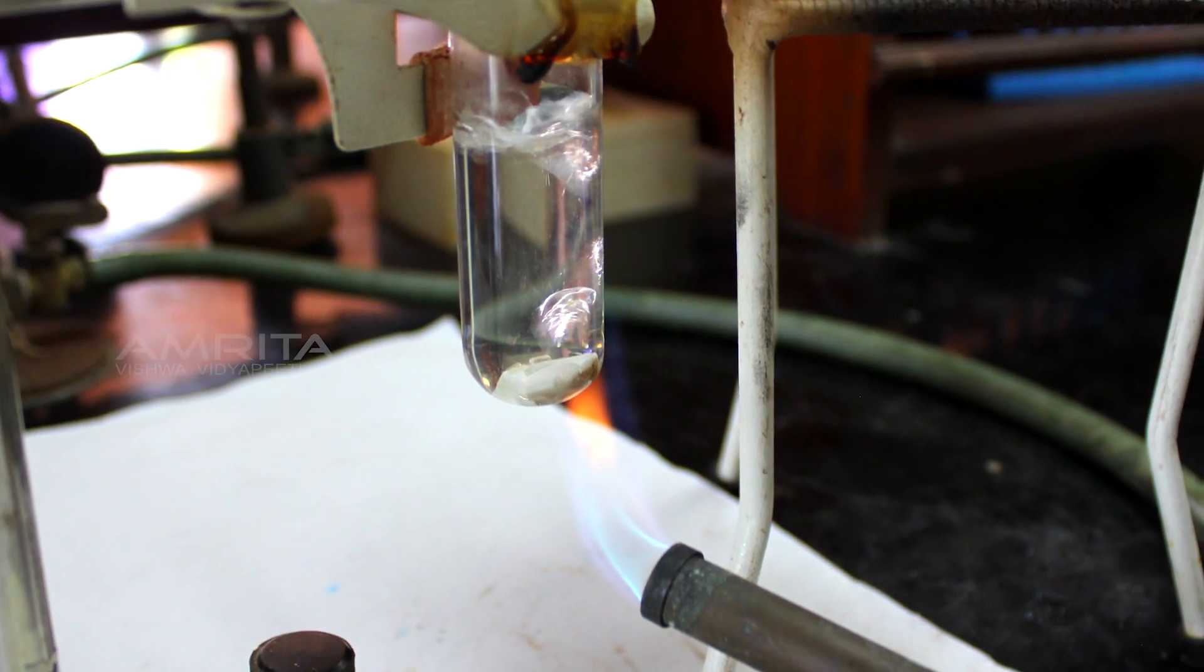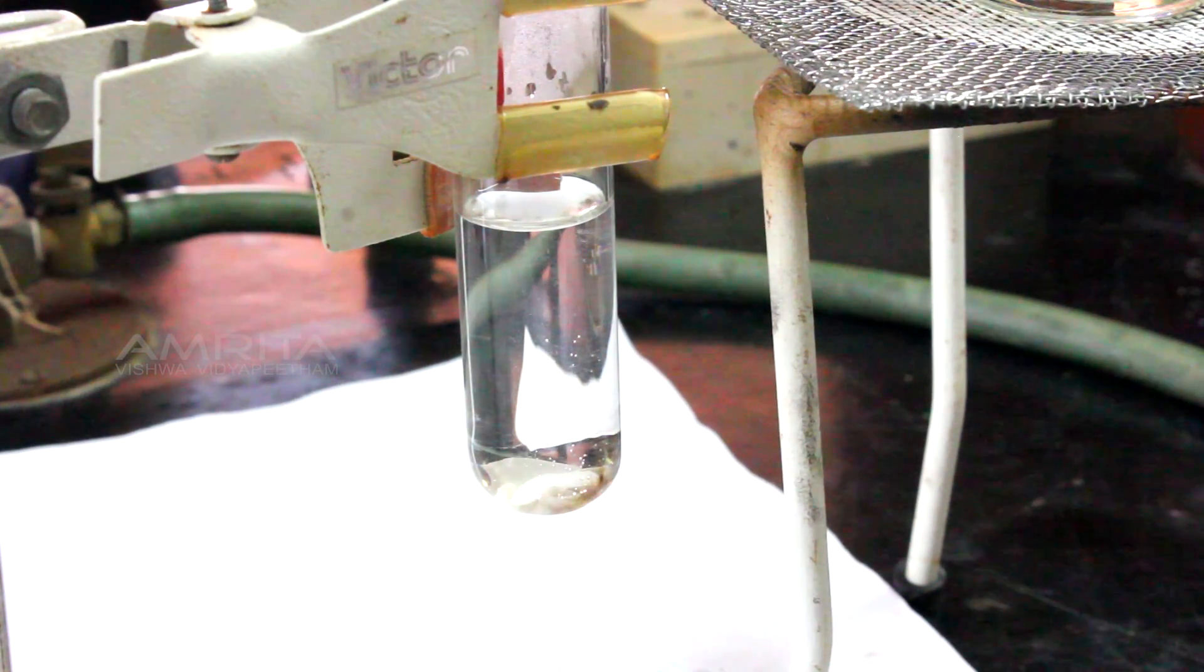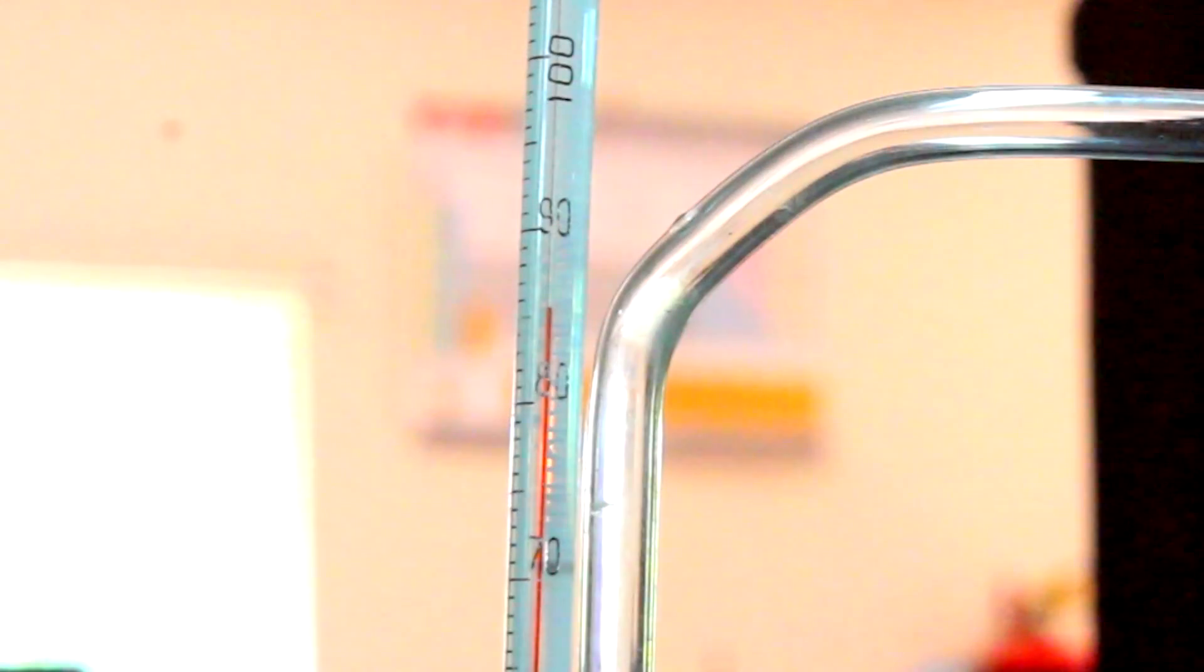Heat the boiling tube by rotating it over the flame of a burner and note down the initial temperature at which the water starts to boil.